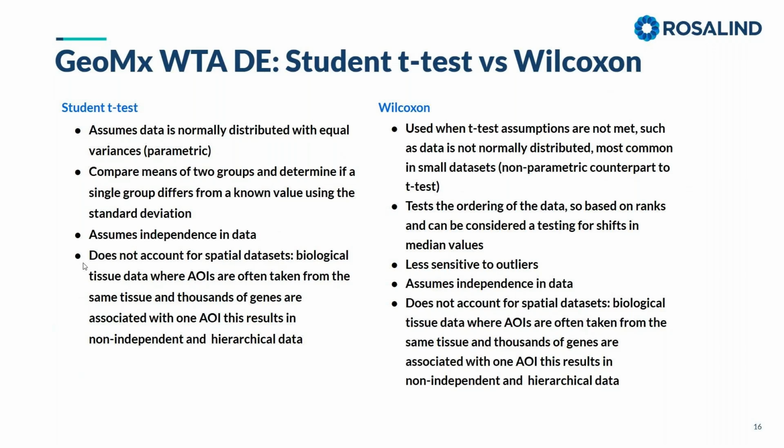These spatial data sets are actually non-independent and hierarchical data sets. So by assuming independence in the data sets, as well as typically assuming one data point is associated with one sample, these tests do not best fit spatial data and can greatly misrepresent your true results.